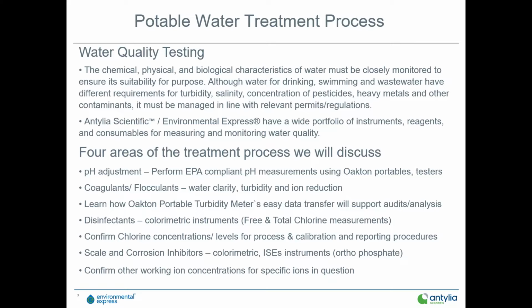We'll touch on disinfectants, specifically colorimetric measurements, free and total chlorine, confirming the concentration or levels of chlorine for process, calibration, and reporting purposes. We'll also touch on scale and corrosion inhibitors using colorimetric and ISE instrumentation.